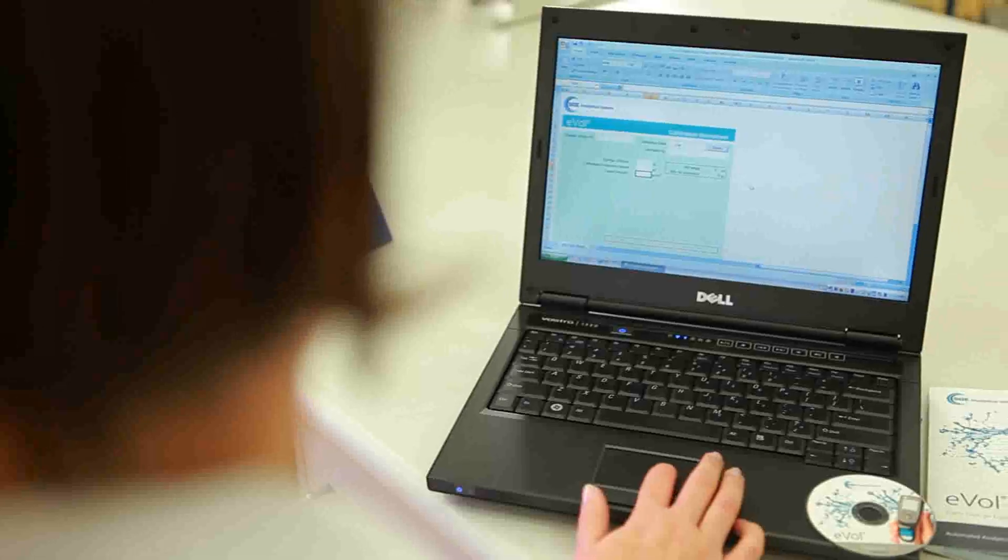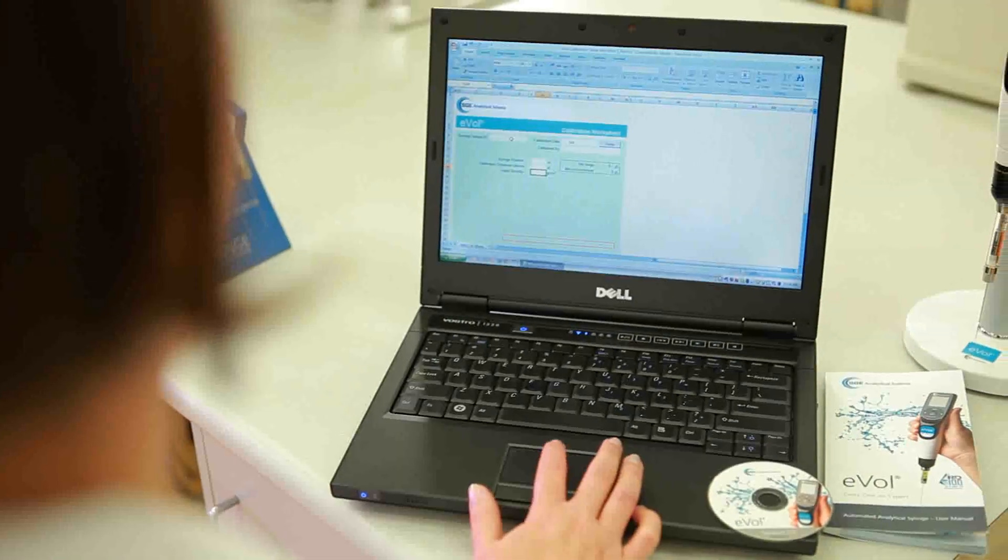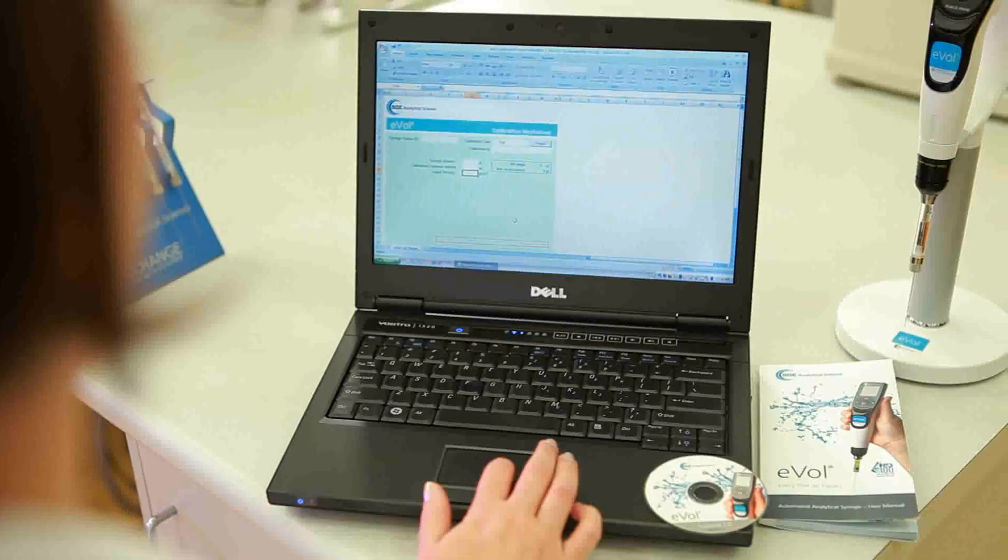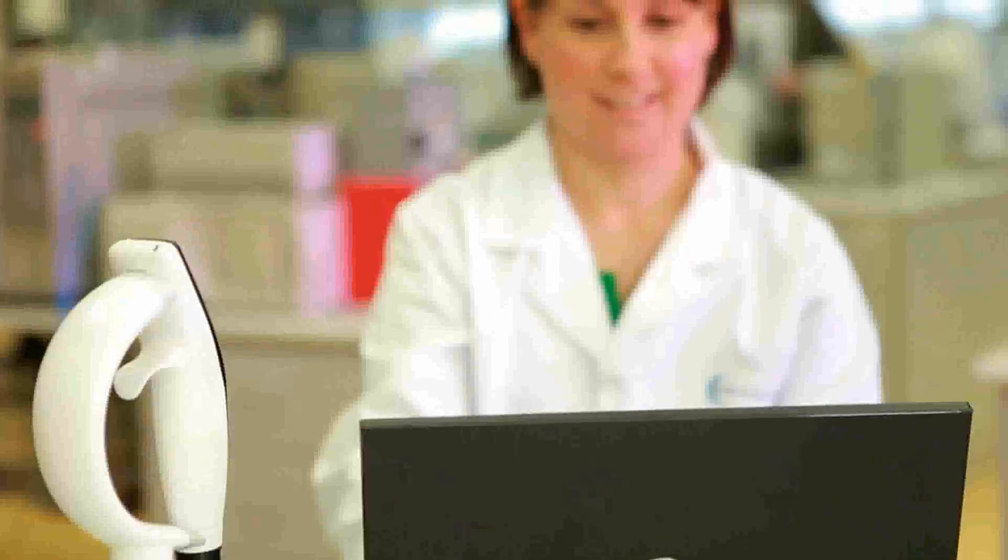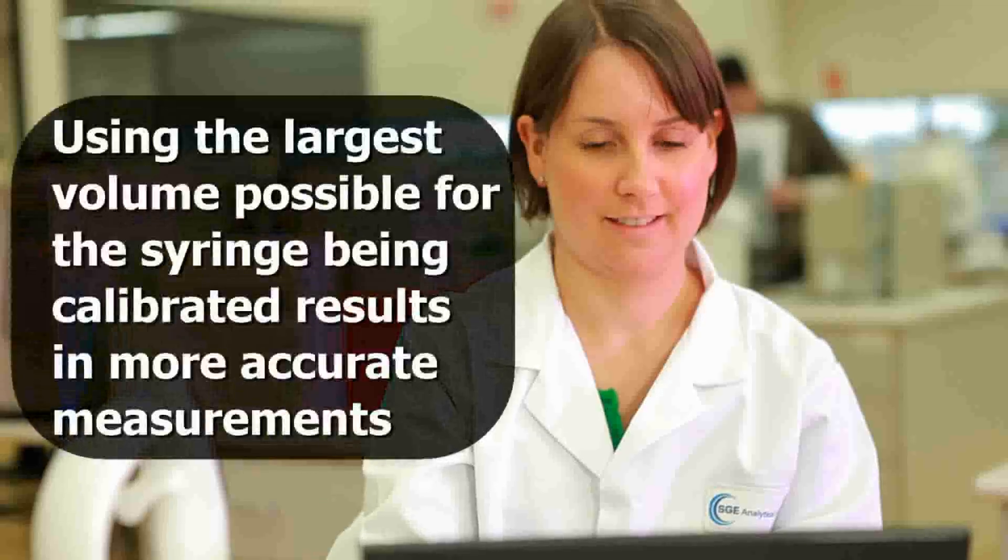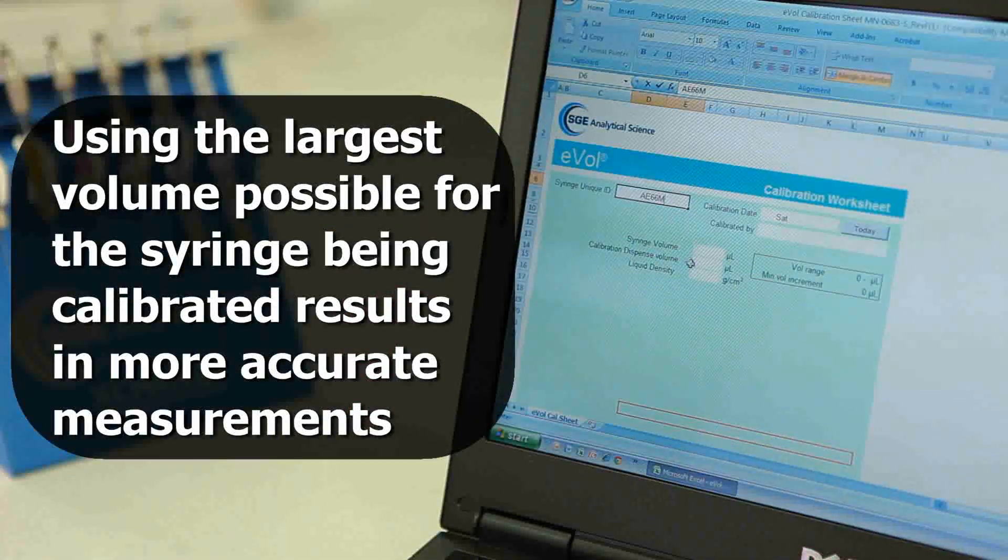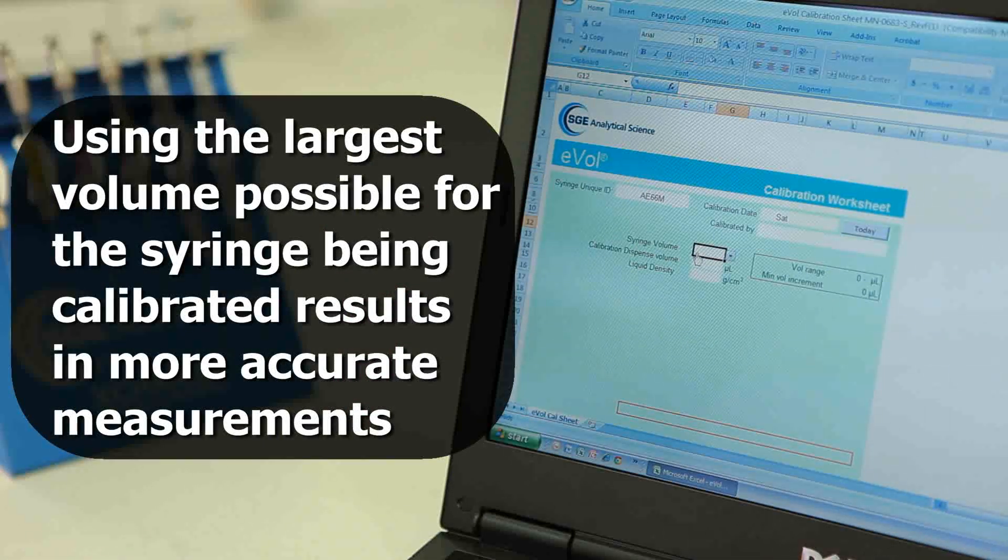Begin the calibration by opening the Microsoft Excel worksheet included on the EVOL kit CD. Then, enter the calibration volume that will be used and the density of the calibration liquid at the temperature of the testing environment.